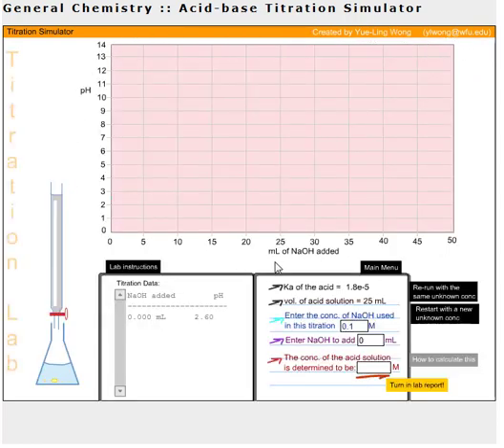So in this window, this is where your pH curve will be graphed as you complete the simulated titration. Here is your burette and the analyte below it.